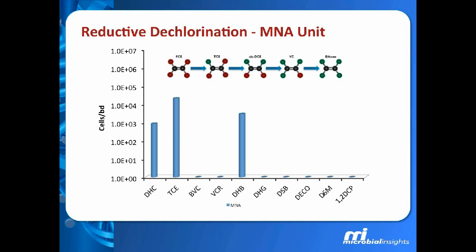And specifically, we found that under natural conditions, there were low to moderate concentrations of Dehalococcoides and Dehalobacter. We also saw that the TCE reductase gene found in Dehalococcoides was present. But it's really important to note that for Dehalococcoides, neither of the vinyl chloride reductase genes were detected. So we're likely to see an accumulation of vinyl chloride at the site.